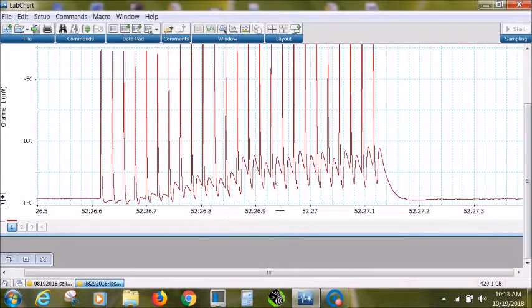This one is about at 52 minutes 26 seconds. Let's zoom out of here.